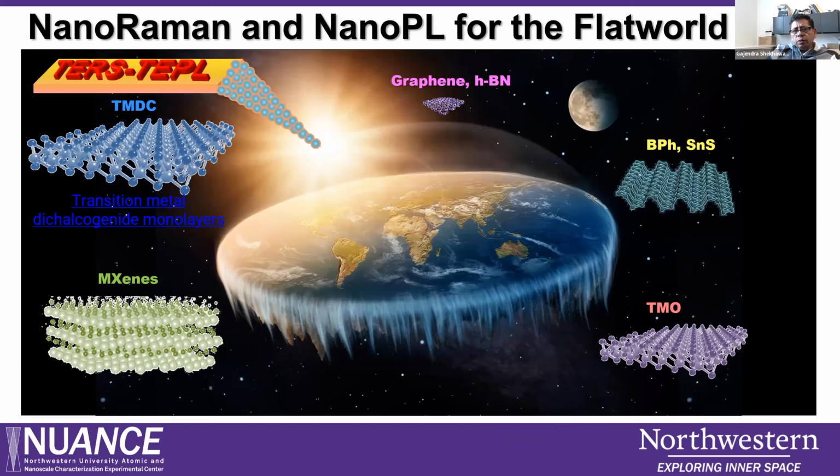And then mostly the nano Raman AFM integration TERS is basically for the 2D world. So 2D materials are the most beneficiary of this technique. A lot of people have also started doing research on identifying viruses, monolayers, and soft materials also. But the best use here is the wide range of 2D materials with this type of technique.